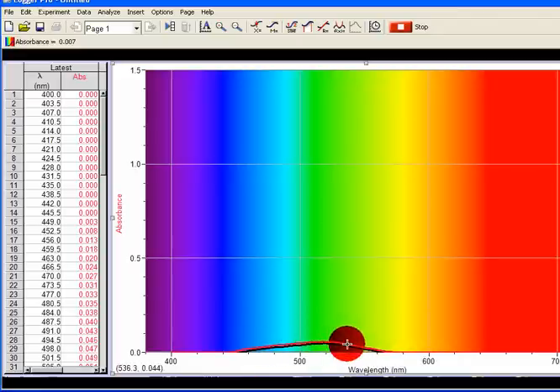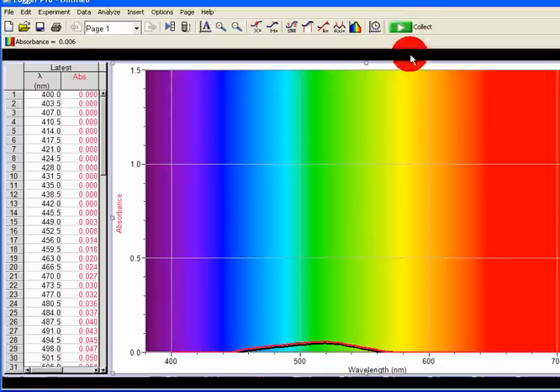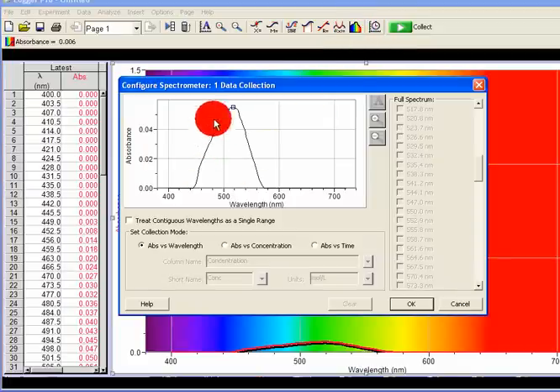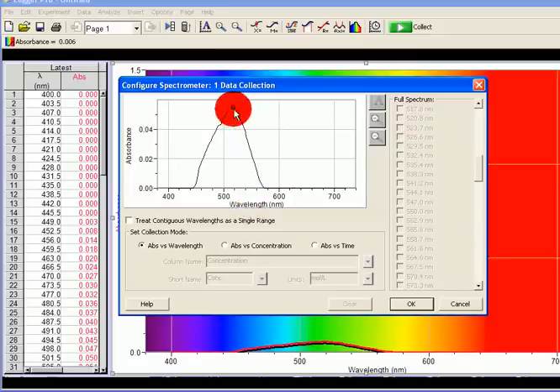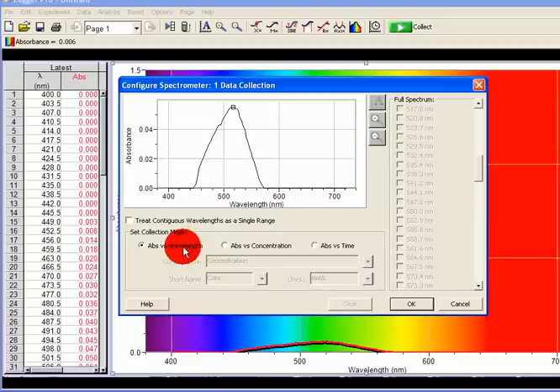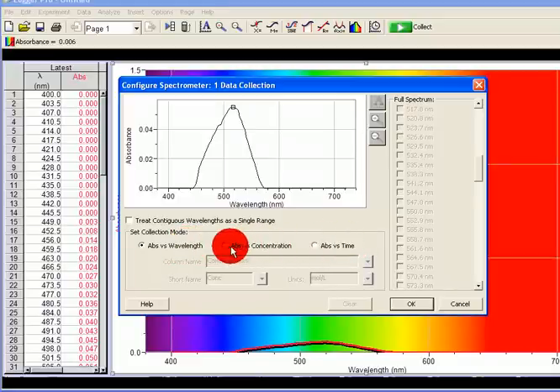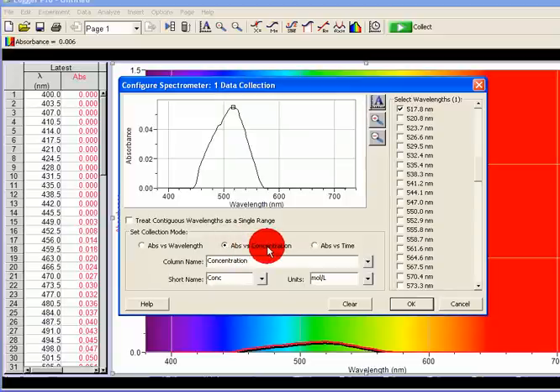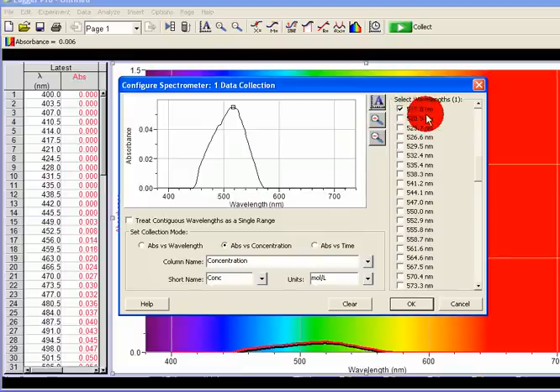So I click on Stop. I get into the Configure button — Spectrophotometer. So I can get absorbance and wavelength. We found out that the absorbance maximum is around 500+. So I get into Absorbance against Wavelength, Absorbance against Concentration, Absorbance against Time — this is for rate. So I click on Absorbance against Concentration. Wavelength selected is 517 nanometers. That is the lambda max. So I'm going to use the selected wavelength.